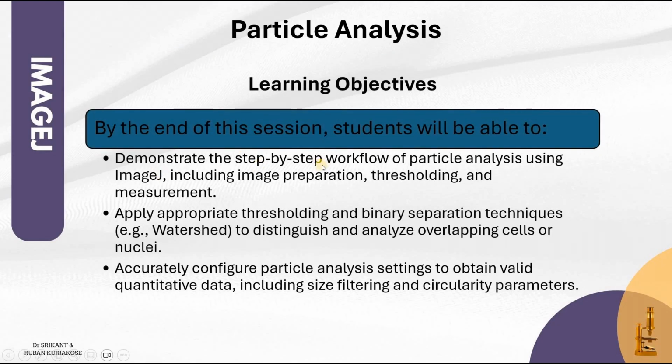So that was about the particle analysis. I demonstrated to you a step-by-step workflow. I showed you appropriate thresholding and the binary separation watershed method. And you can configure your particle analysis based on the size, and we also showed the various measurements. So that was about particle measurement.